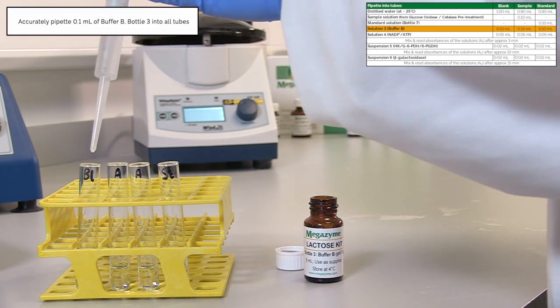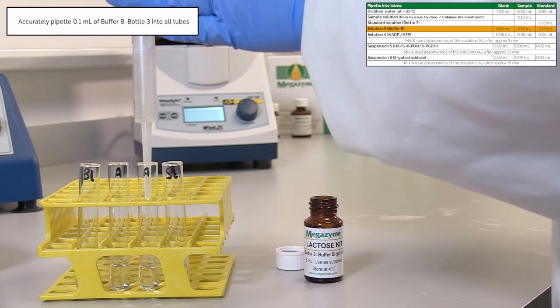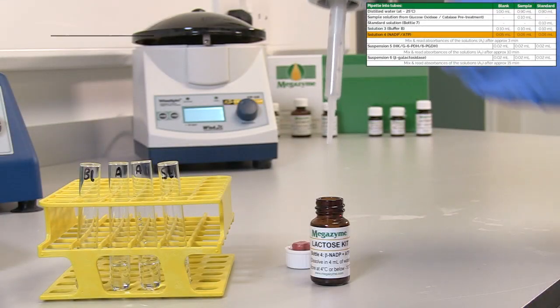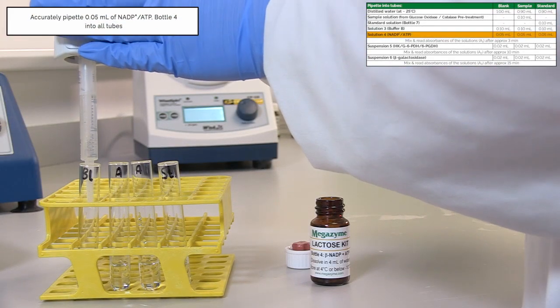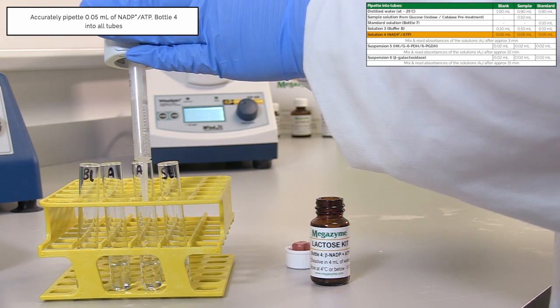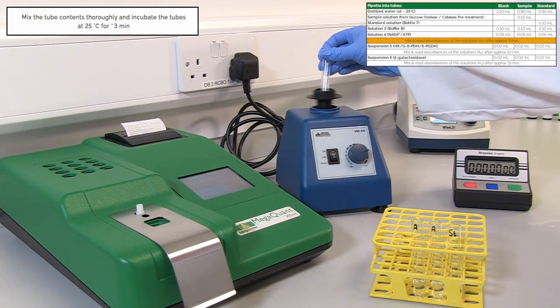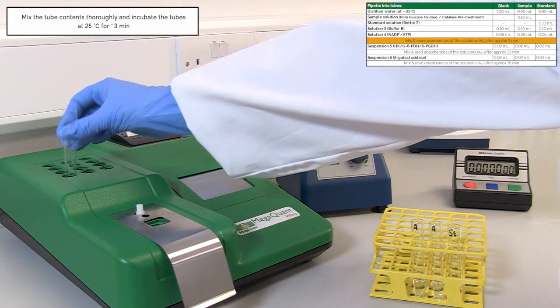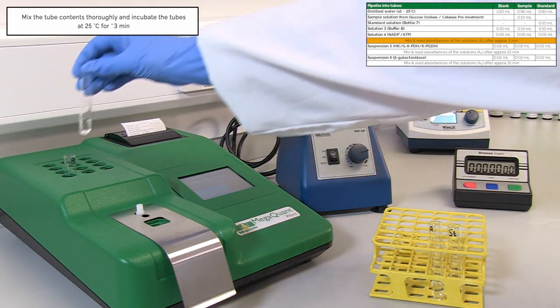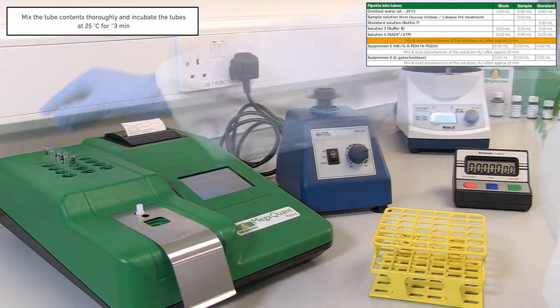Accurately pipette 0.1 ml of buffer B, bottle 3, into all tubes. Accurately pipette 0.05 ml of NADP plus and ATP, bottle 4, into all tubes. When all of the components have been added, mix the tube contents thoroughly and incubate the tubes at 25°C for approximately 3 minutes, either in the onboard incubator on the Megazyme Wave or in a separate incubation block.